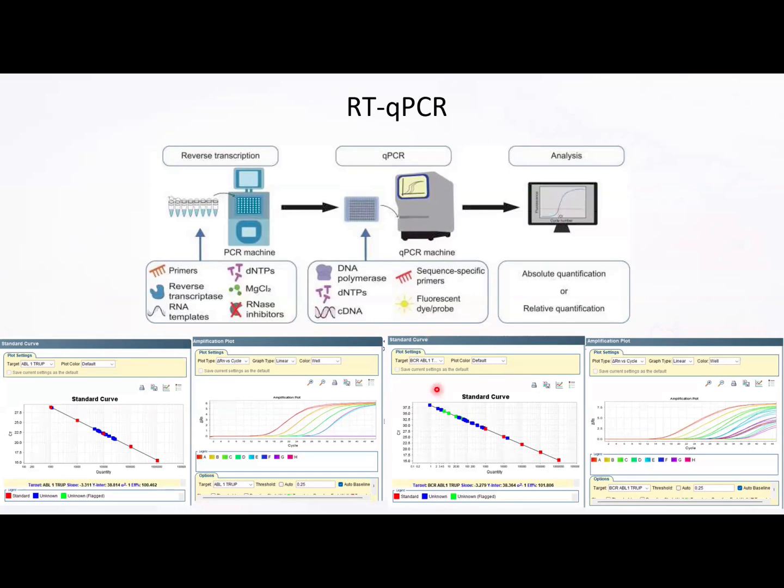And over here you can see BCR-ABL. So there will be different primers and probes. Again, RT-qPCR, I'll elaborate it later. In this there will be primers for ABL1 along with a probe, which will amplify at certain CT values. The absolute values of this will be used to create a standard curve against which the values of the sample will be plotted. So this red represents the standard, and you can see a very close knit ABL1 cluster, meaning all the RNA was in the same zone, or the QC metrics of the extraction have passed.